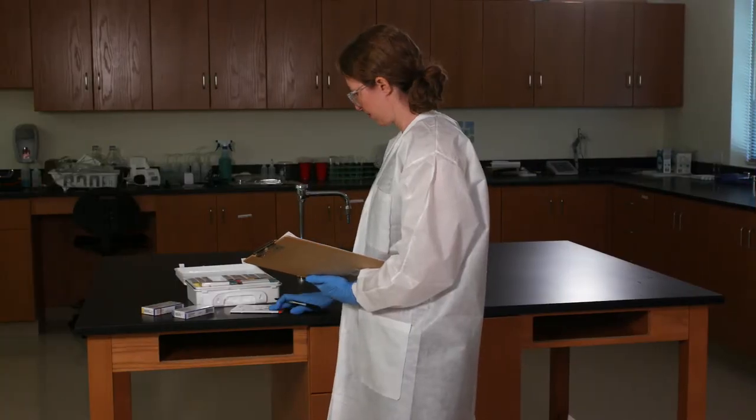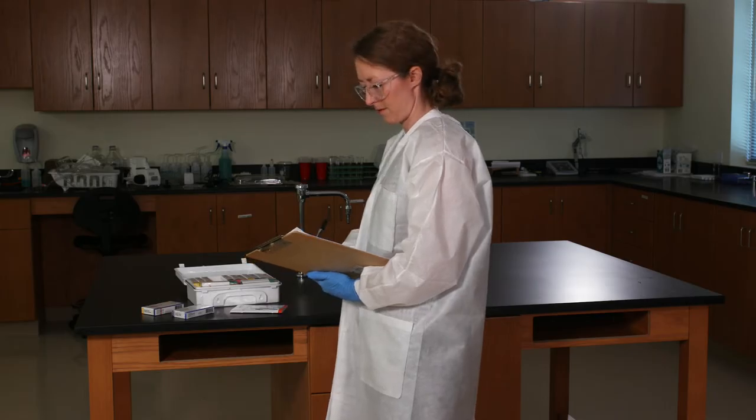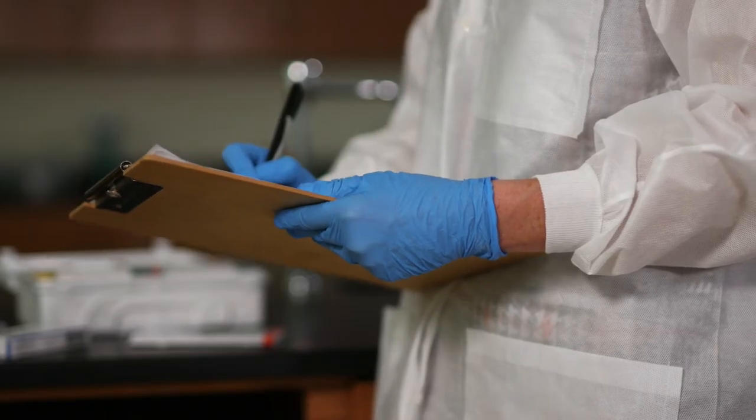A safety survey is a tool we use to proactively identify hazards and the corrective actions we need to take. Regular surveys are an important part of a company's occupational health and safety program. You're going to have a chance to practice. Your instructor will give you a survey checklist, but pay close attention because your instructor is sneaky and may have planted some hidden hazards.